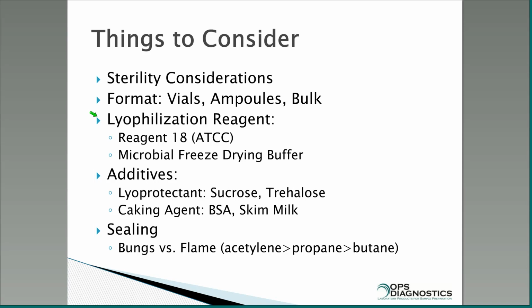What I generally call lyophilization reagents have to have a lyoprotectant that protects your organism, but ideally it will also have something to help form a nice cake or solid matrix for your organisms to be suspended in. Now the ATCC has a real nice reagent, called reagent 18, which is a pretty straightforward reagent that consists of, I think, about 10% sucrose and 5% BSA and a little bit of tryptic soy broth. Reagent 18 is a very standard reagent and it works very well.